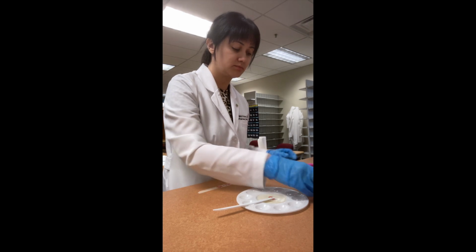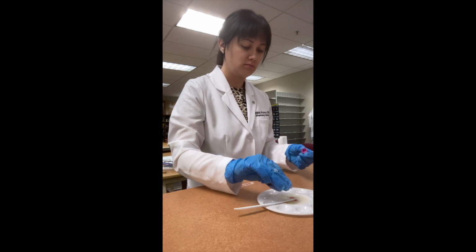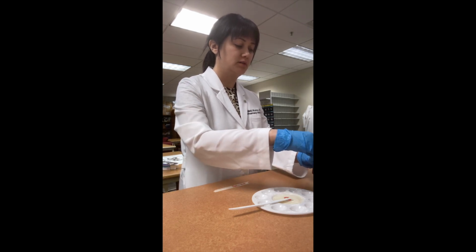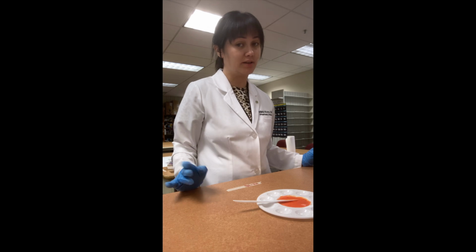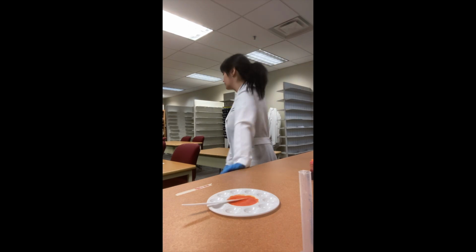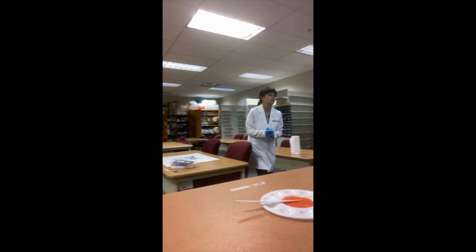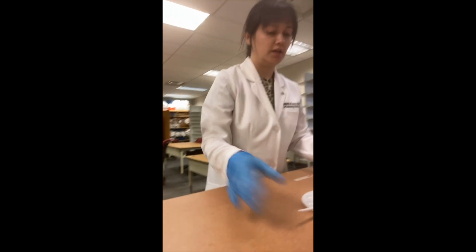One. And one. Okay. And once again, mix them up using spatulation. Okay, so now that my color is pretty well mixed, now I can go to this table, use my paint as I'd like. After I'm done with that, you can move over to this table right here and package up your paint.